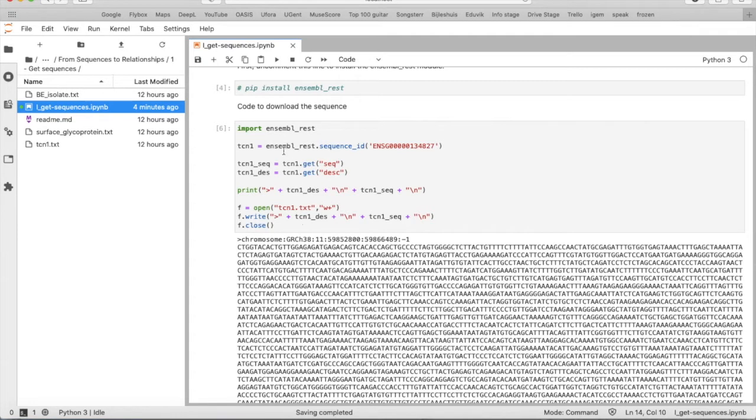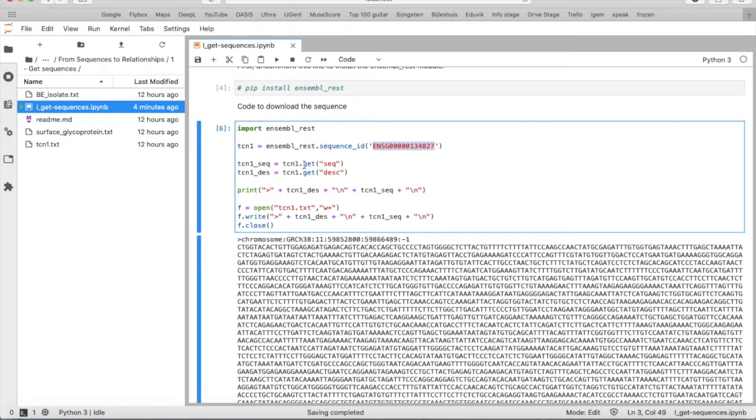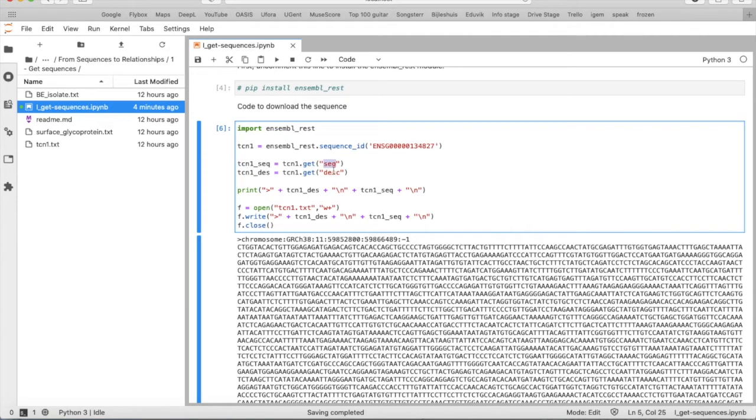So we say EnsemblRest.sequence_id, we put the accession number between, and then we say the sequence is TCN1.get, so we get something out of this TCN1 object, the sequence and then description as well.